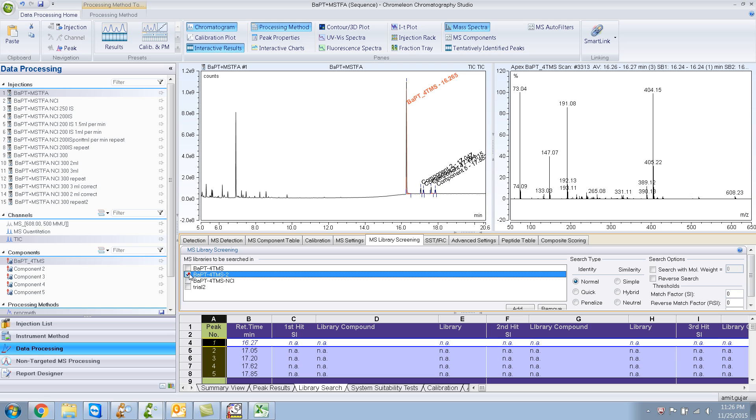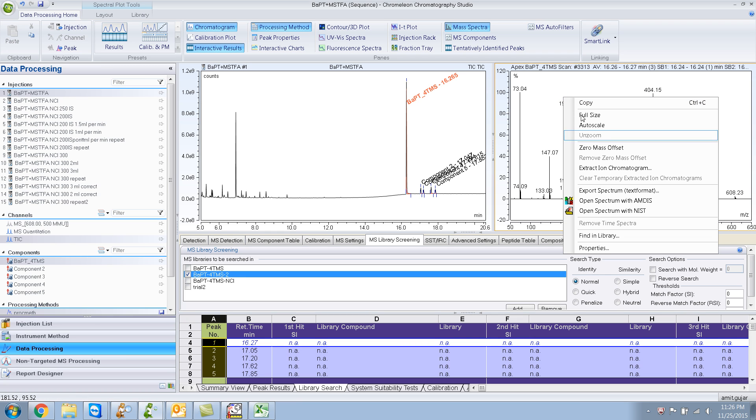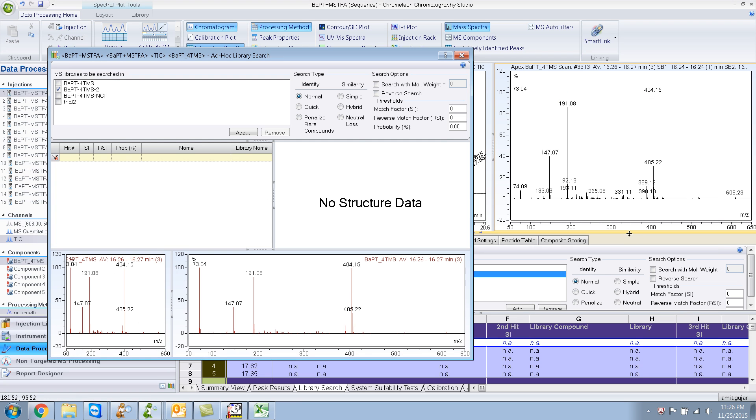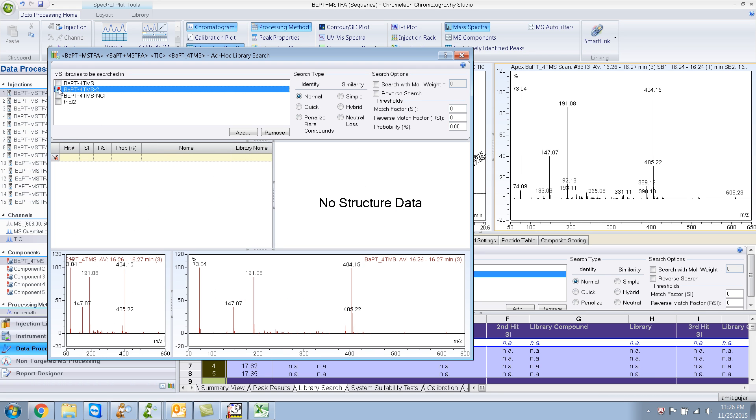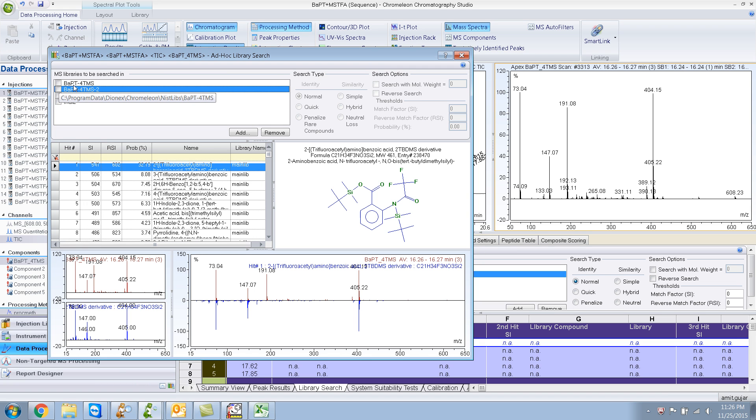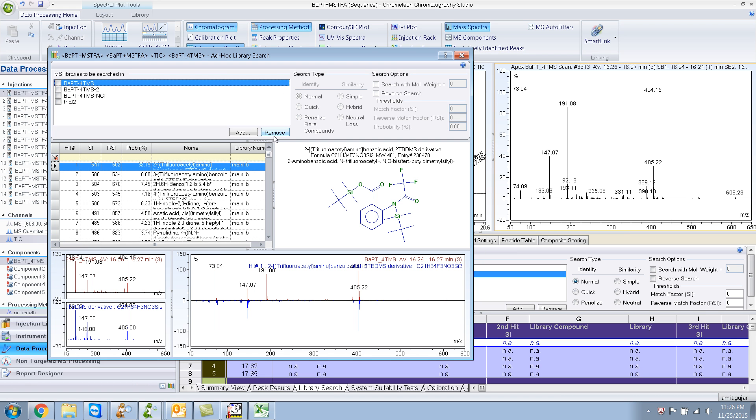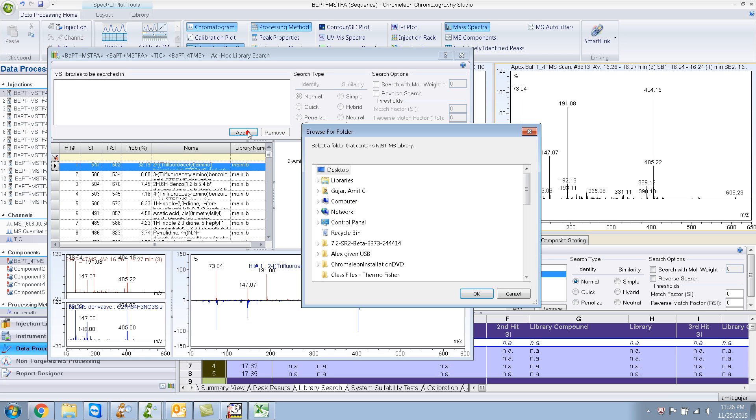Let me try it this way. Nothing shows up. Okay, let me do this. Let me remove all the libraries first because I was playing around a lot. Let me add it once more.